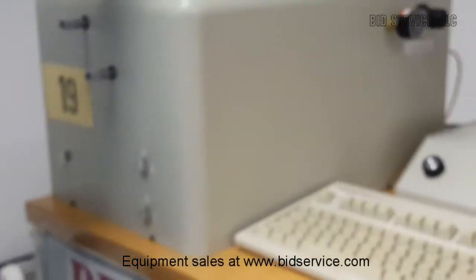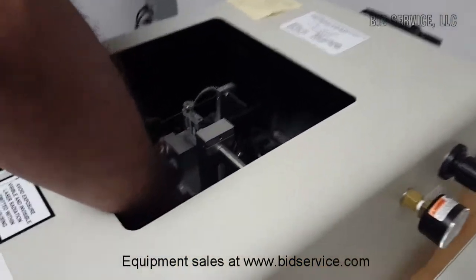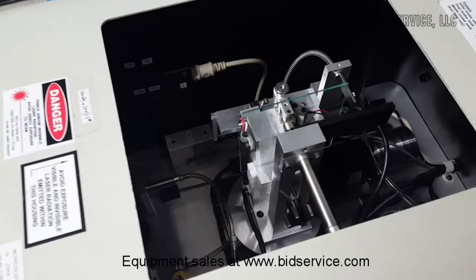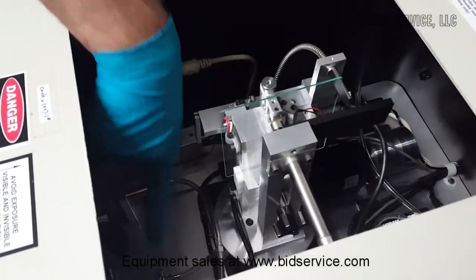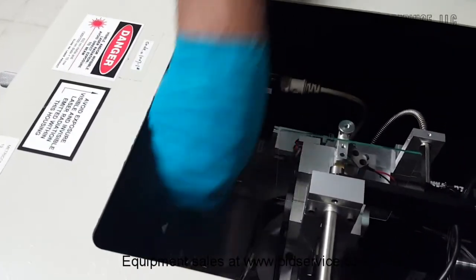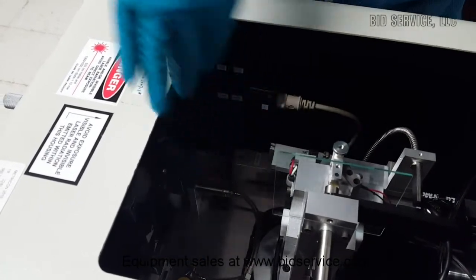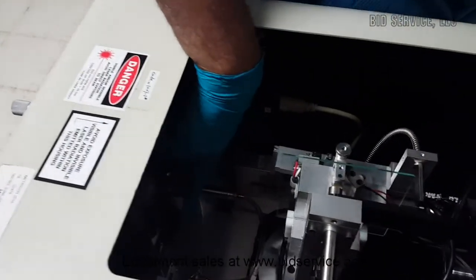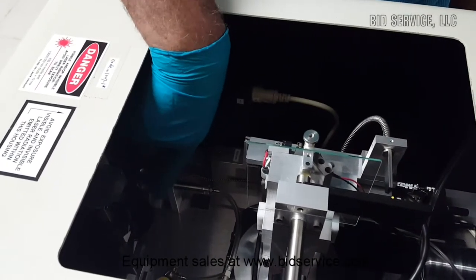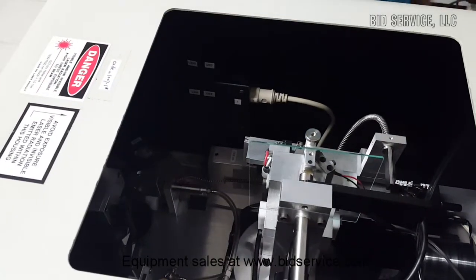And there's a manual slide inside. In order to get the 1300 nanometer laser in line, the slide has to be pushed in. For 1550, the slide has to be pulled out like that, and it has to be pushed in for 1300 nanometer. And there is a manual attenuator here for the laser. If it's a brand new laser, the intensity could be high, so at that time this has to be rotated to normalize the signal.